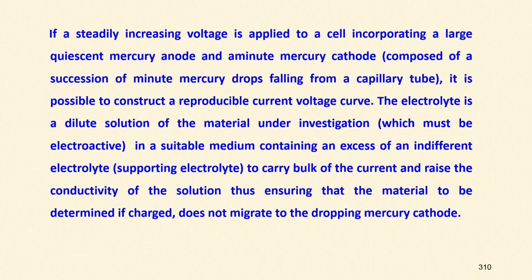So, here in polarography, what I do normally is I take a substance to be reduced. Normally, most of the chemical reactions involving polarography are redox reactions. Most of the metals will undergo them anyway.